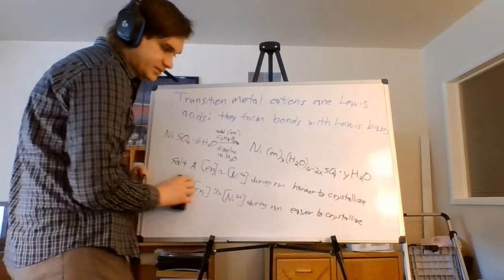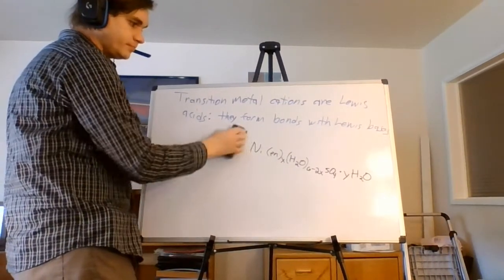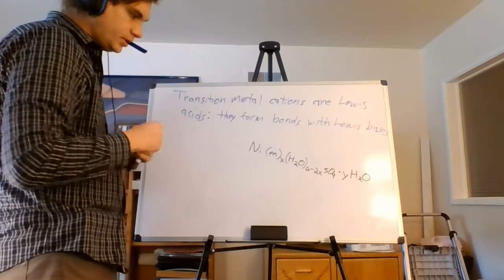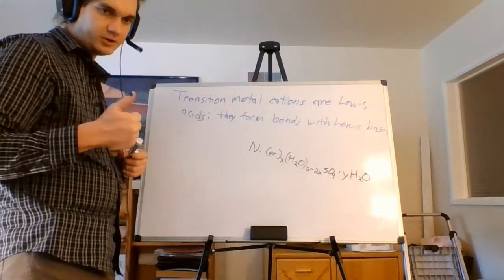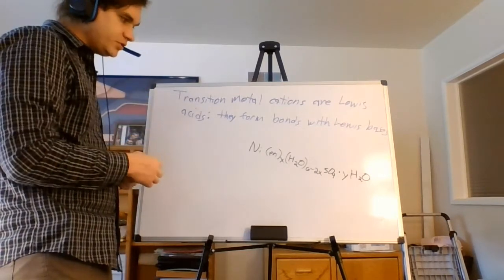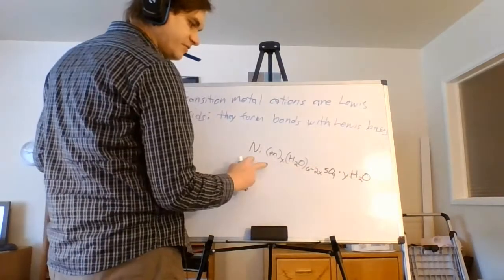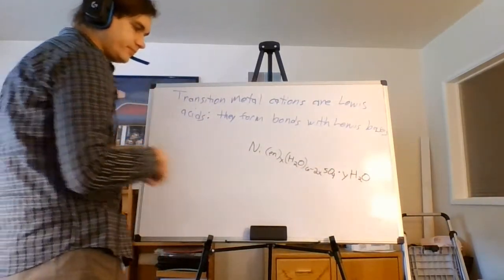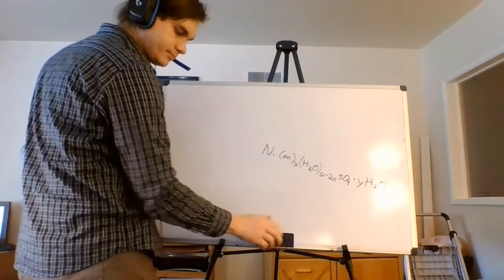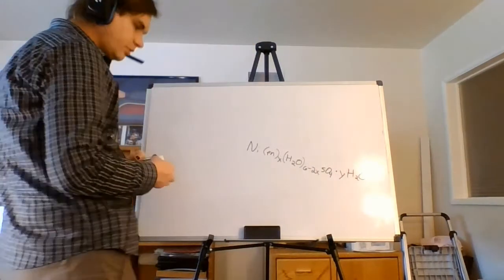Now let's talk about the analysis. Our analysis is going to be, first of all, the yield of the reaction, and secondly, we're going to want to know what are the values of each of these.